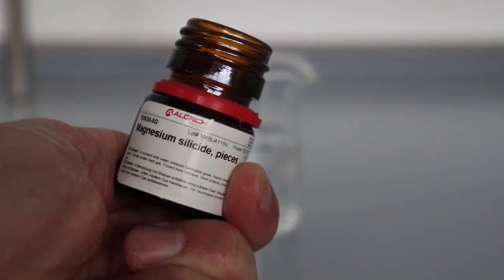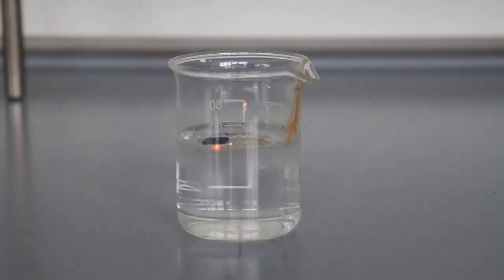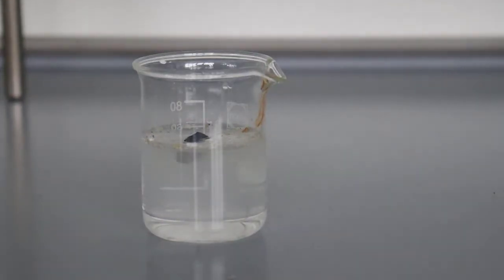Hello again. This time we're interested in the reaction of silane with air. So when we make some silane directly by putting this in, we see the reaction immediately. Silane reacts with oxygen in air instantly, it bursts into flames and kind of explodes. It's very similar to the reaction of methane with air.